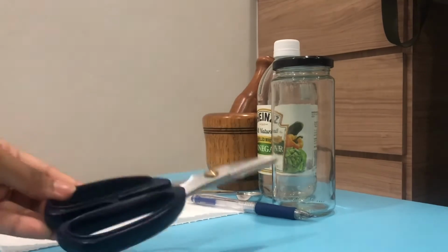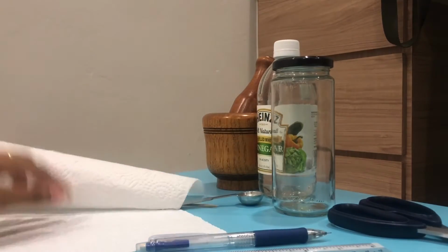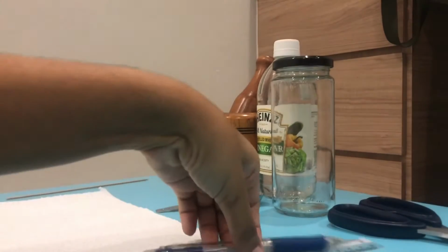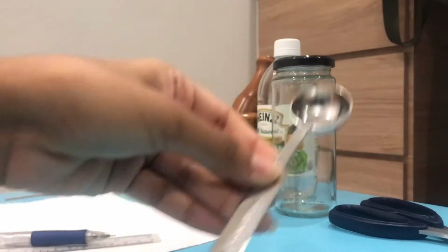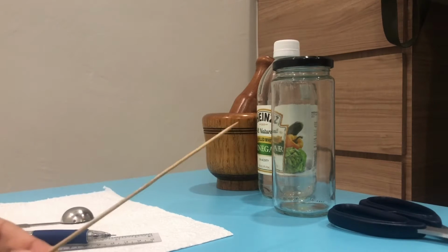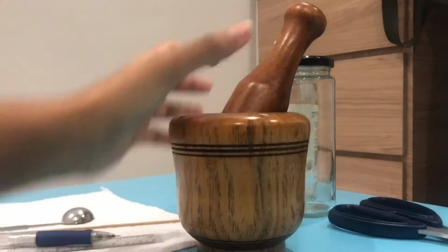I'm using the scissors to form the TLC plate, and to measure it I'll have a pencil and a ruler, and then I'll have this that will be the TLC plate. I'll be using paper towels, and for measuring I'll be using this, a 5 ml teaspoon. This is a measuring teaspoon, and then this, because I don't have a small needle to place the sample on the TLC plate, and then this will be my pestle and mortar.